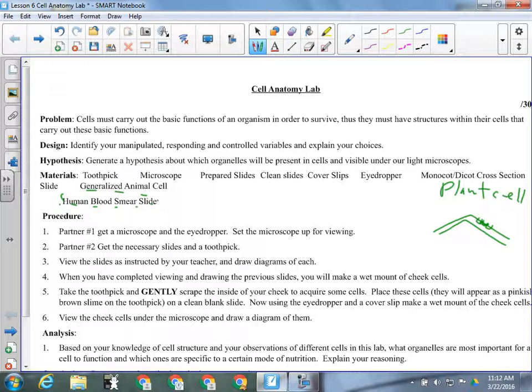On there will be a whole bunch of your own cells, and even though they're not stained a color, these are usually the ones you can see the most structures in. If we fiddle around with the light on the underneath side of the stage, there's a little lever that opens and closes the iris on the bottom. As you play around with that, you can increase the contrast of what you're looking at, which makes it look sharper. Suddenly they'll just jump out, and you'll see all these structures within the cells once you find a cell.